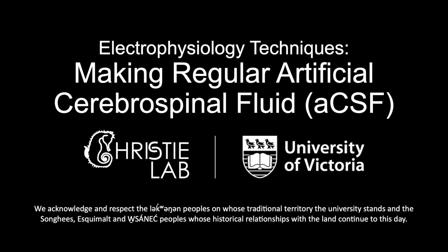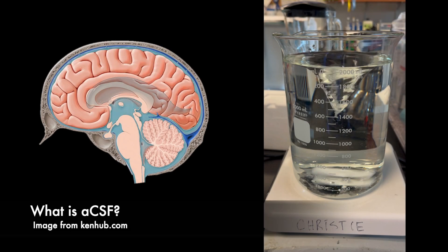In this video we'll show how to make regular artificial cerebrospinal fluid, or ACSF, for use in electrophysiology experiments. In electrophysiological experiments, researchers study the electrochemical properties of neuronal pathways or individual neurons. Therefore, mimicking normal physiological conditions is essential for neural tissue health and vitality.